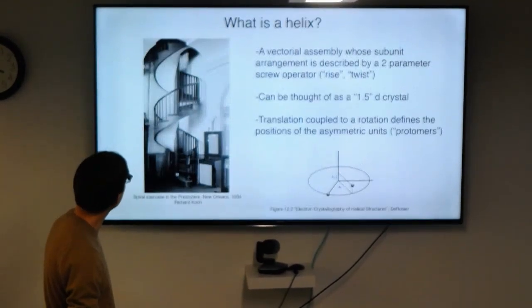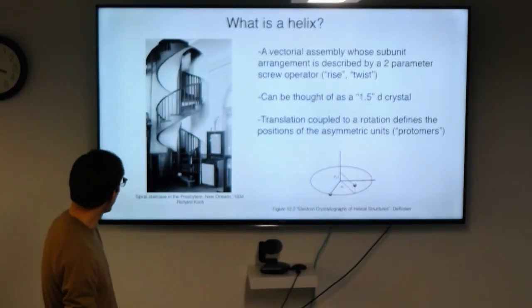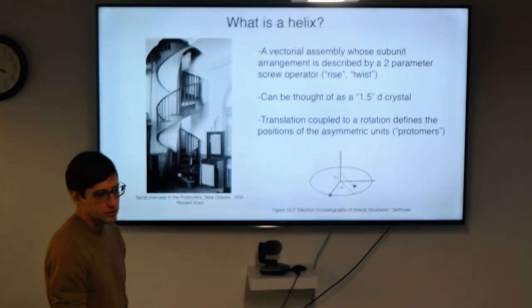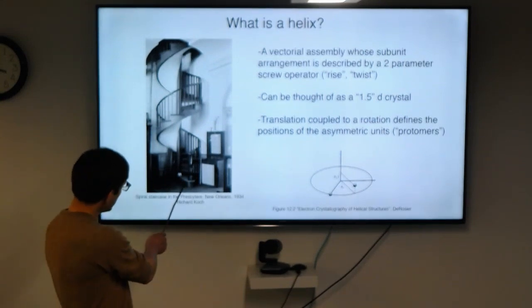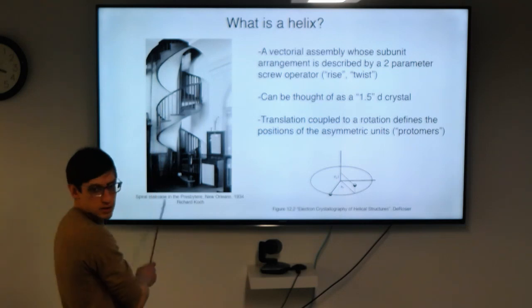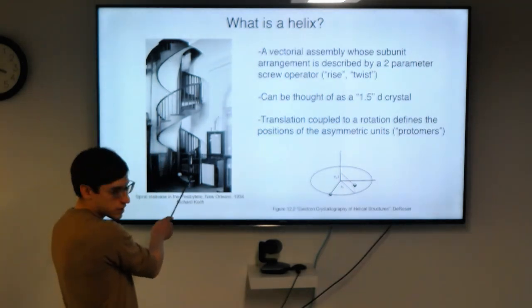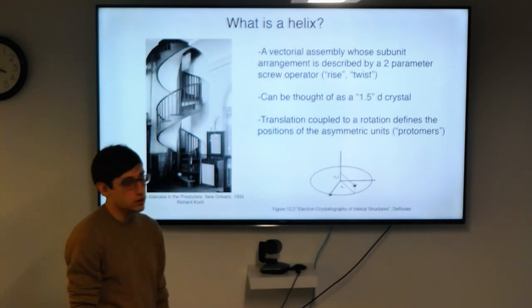Okay. So what is a helix? Let's start with that. I think you encounter helices in your everyday life quite a bit. An example that I like is a spiral staircase, right? So you can see here you have steps going up around a central axis, and as you go up a step, you also have to rotate to continue around that axis. And really that is the fundamental definition of a helix.